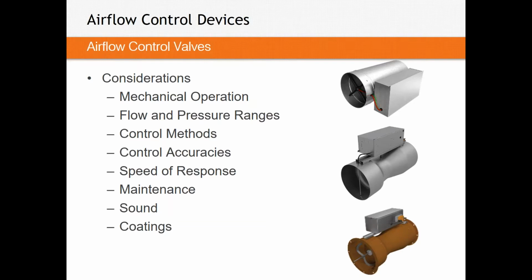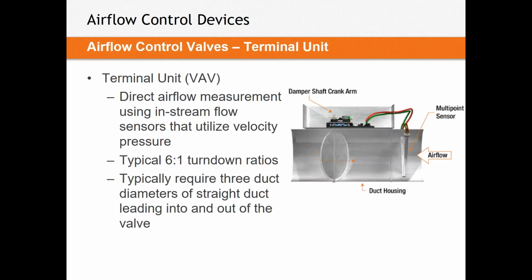We're actually going to break down 4 or 5 different ways to describe that. And that's the part of the talk I like to give the best. Then we're going to tail off here, talking about maintenance, sound, and finally, not just coatings but mechanically what is typically available for these valves. Again, as we go through here, please ask questions on the side panel, and we'll try to touch on them all at the end.